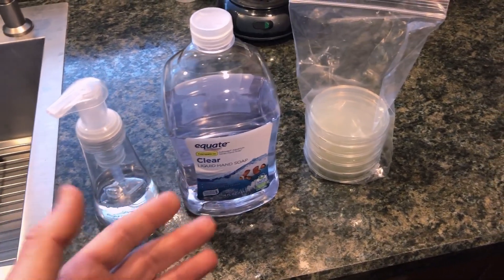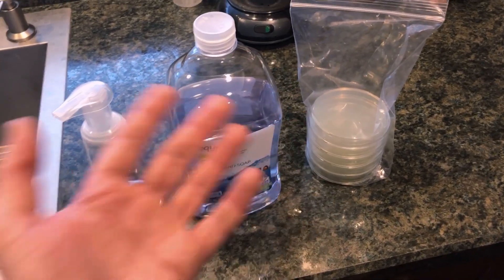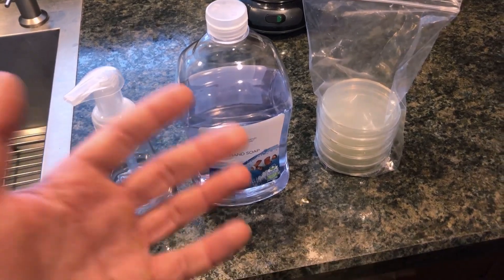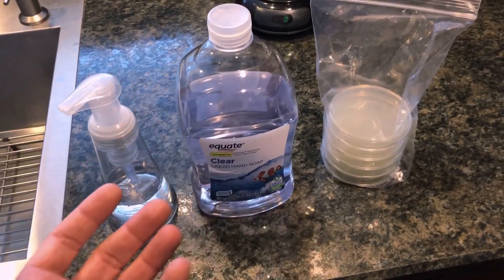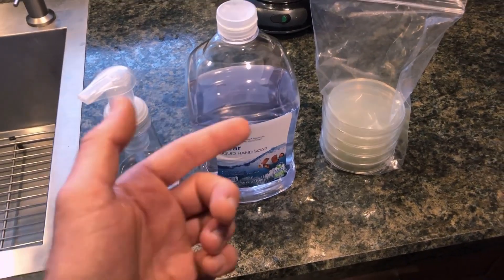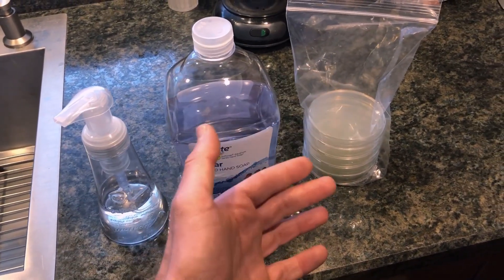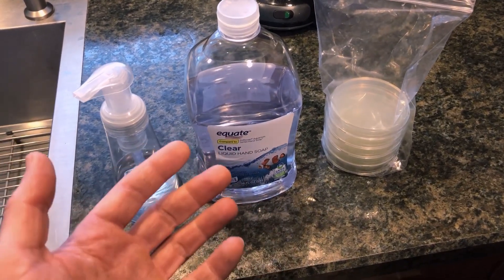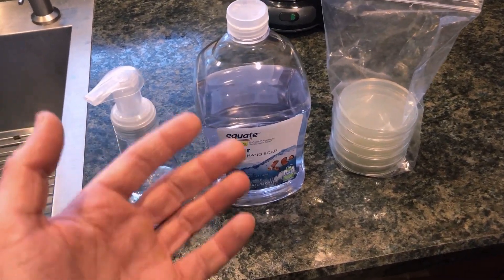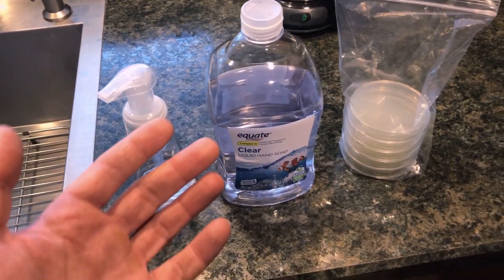So in that first video, I actually touched one of the agar plates before I washed my hands just to see how dirty they actually are before anything else is done as a kind of control. I'm not going to do that in this video because I only have five agar plates here. But if you want to see how dirty your hands actually are before you wash them, go ahead and watch the first video.